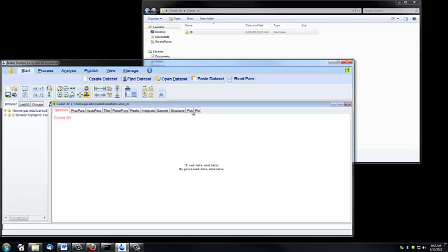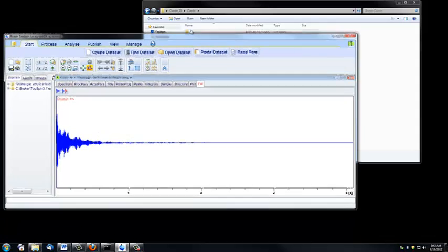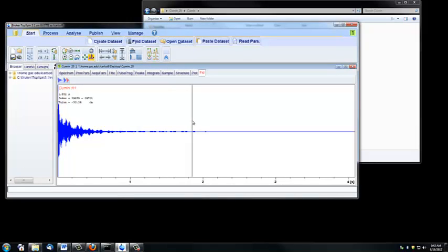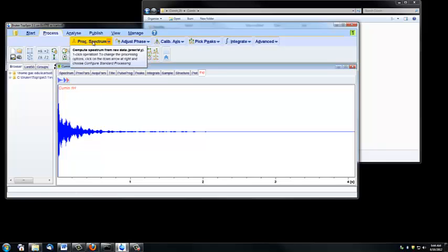If we click on this FID tab, we'll see the free induction decay pattern, which is the raw, unprocessed form of your data. To change this FID into a readable spectrum, I'm going to use the Process Spectrum tab, which is under Process, and then I click Process Spectrum.